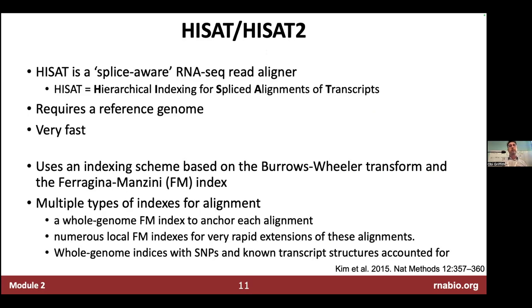Let's briefly cover how HISAT works conceptually. HISAT is a splice-aware read aligner — it stands for Hierarchical Indexing for Spliced Alignment of Transcripts. It requires a reference genome, is quite fast, and uses an indexing scheme based on the Burrows-Wheeler Transform and the Ferragina-Manzini index. We already indexed our data using the HISAT build command, creating those .ht files, which is the foundation of how HISAT works.